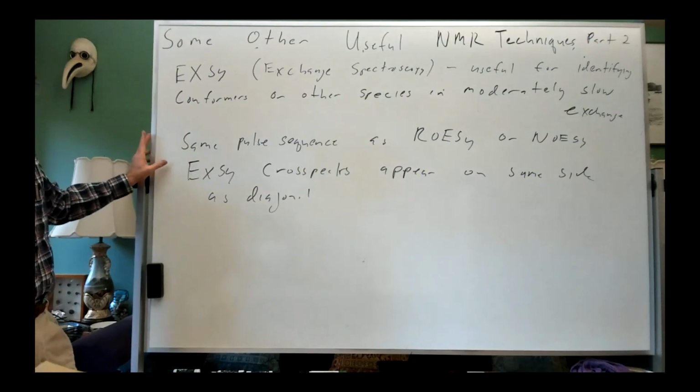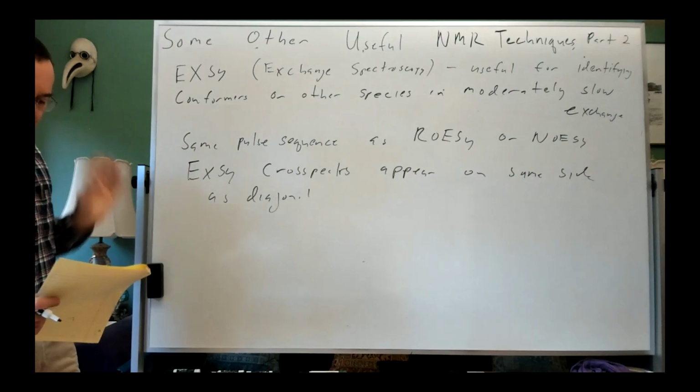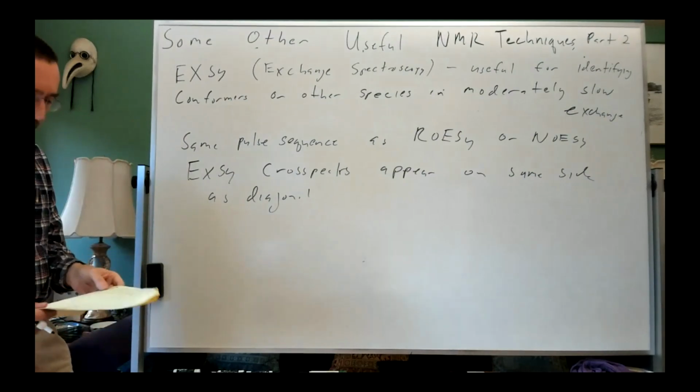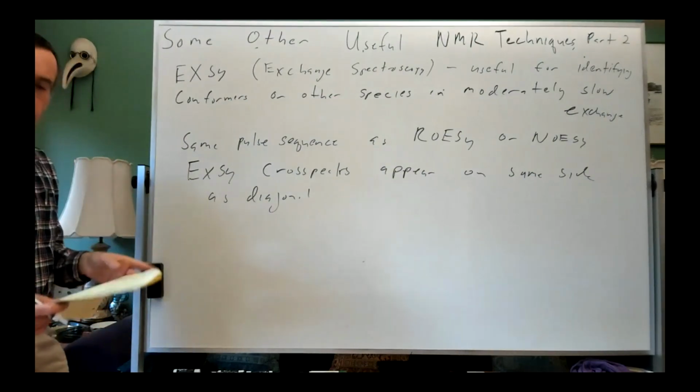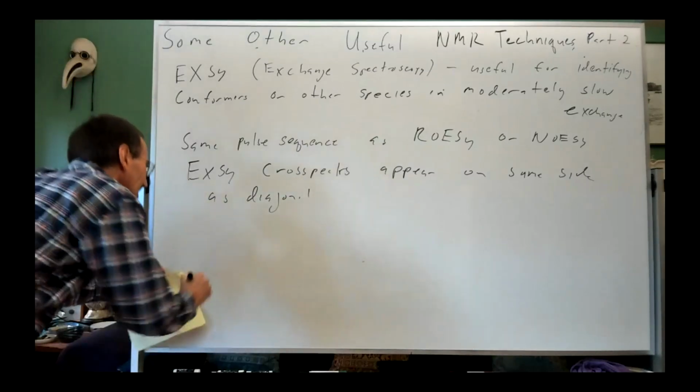And from an operational point of view, there's one thing that's key here. You basically need to adjust your temperature so that the peaks broaden slightly.